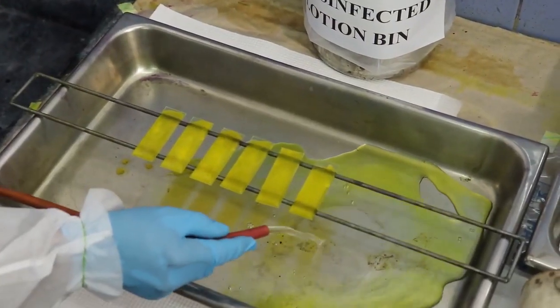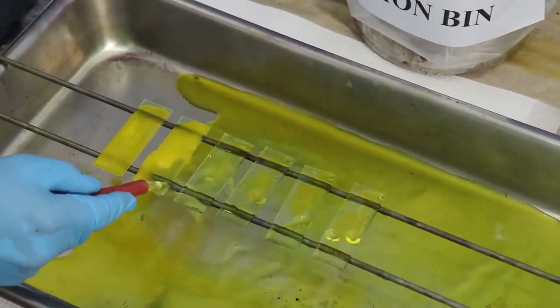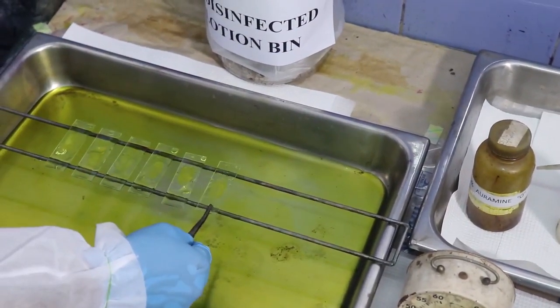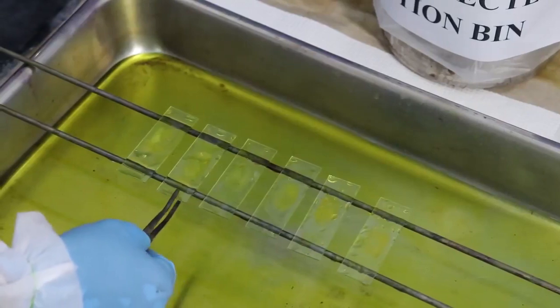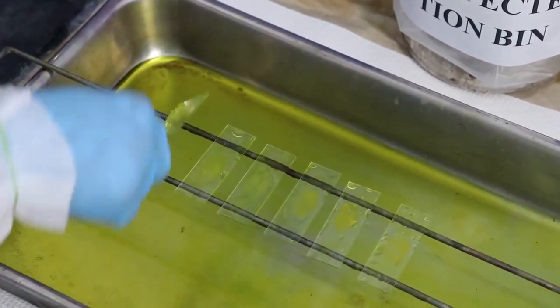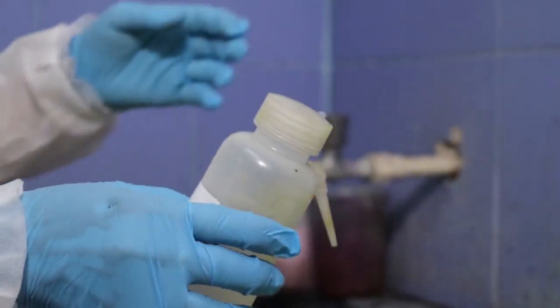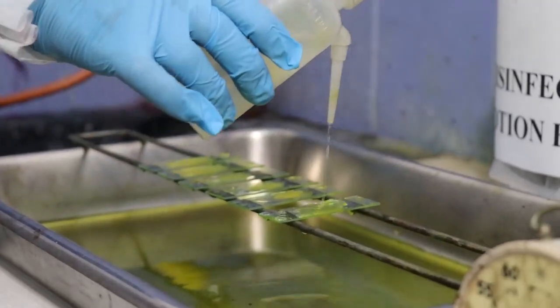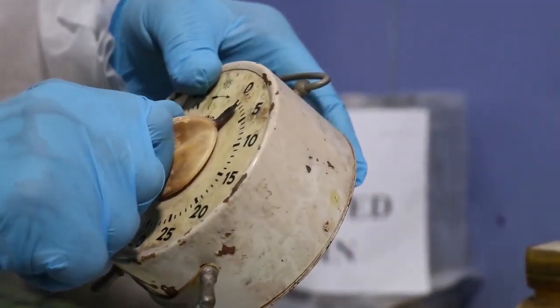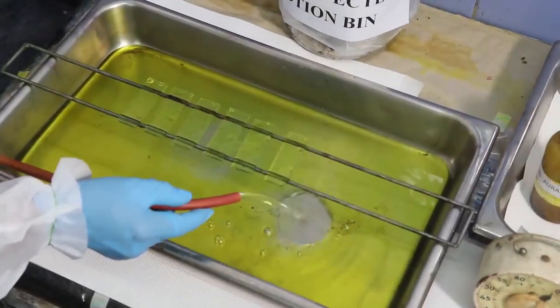Rinse the slides gently with tap water until all free Auramine O stain is washed away. Tilt the slides to drain out excess water. Pour decolorization solution onto the slides. Let the slides stand for 2 minutes. Rinse with tap water.